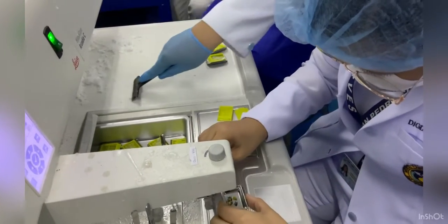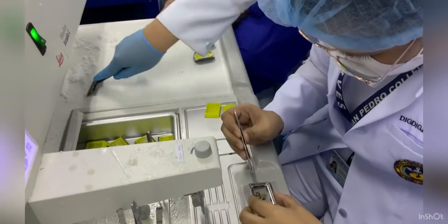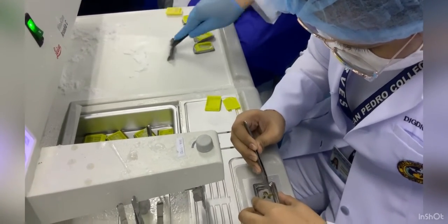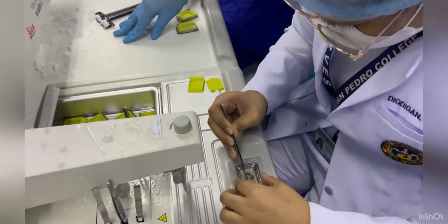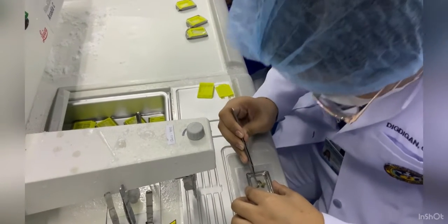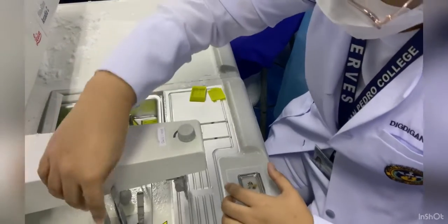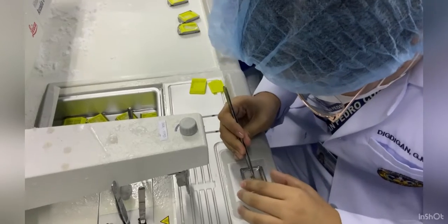Next, put a small amount of paraffin wax and make sure that the specimen is in the center. Then gently press the specimen while the paraffin wax is solidifying. The purpose of this is to prevent the tissue specimen from being positioned off the center of the block. In that way, it will be easier for section cutting.